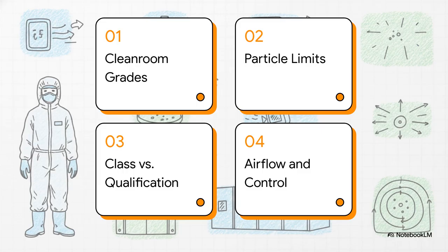Here's our agenda. 1. Cleanroom grades. 2. Particle limits. 3. Classification versus qualification. And 4. Airflow and control.